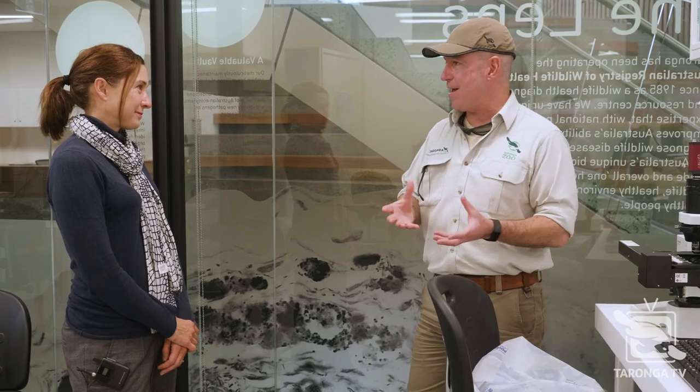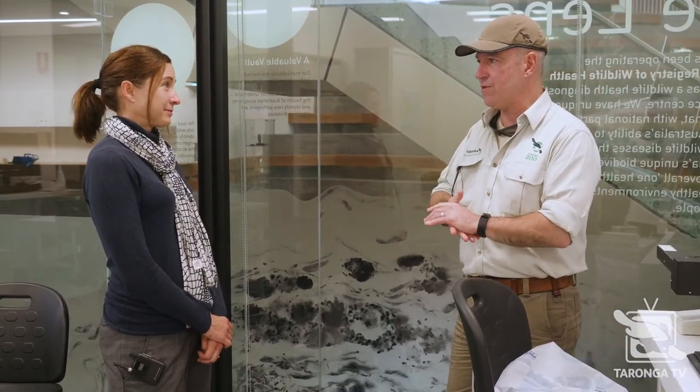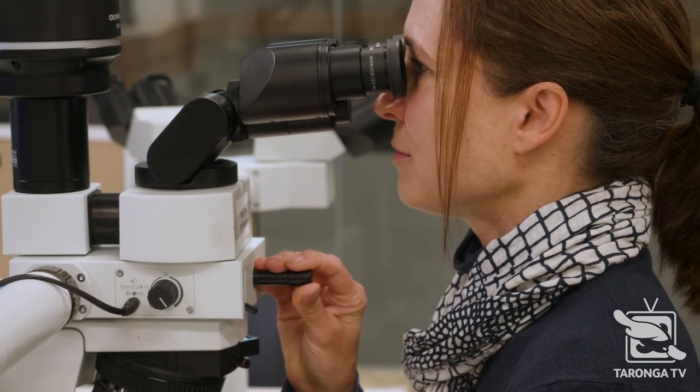One of the things I really want to share is that this goes on behind the scenes at Taronga. A lot of people don't even know about it, and that's what I love about Taronga TV. We can meet people like you. You can show us what goes on and how much work goes into protecting wildlife around Australia and around the world. When you make a slide, you go old school, with the cover slip on top of the slide and everything.